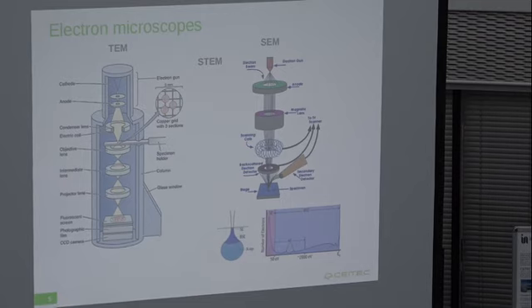On the other hand, the backscattered electrons can penetrate deeper into the volume of your sample, bringing information from deeper in the sample, and you can use them to learn not only about the morphology, but also about the chemical composition of your specimen.